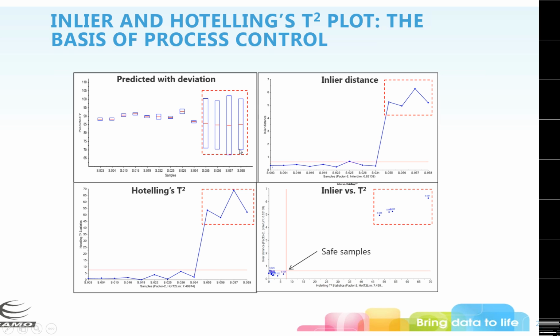If all you care about is the octane level and you want to make sure that it's predicting well, you might cut that area out because those variables are changing with the additive rather than the actual octane level.